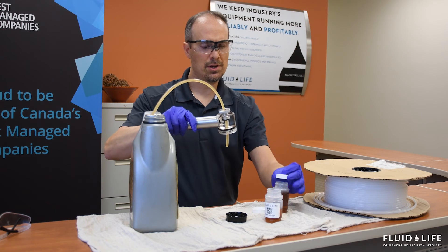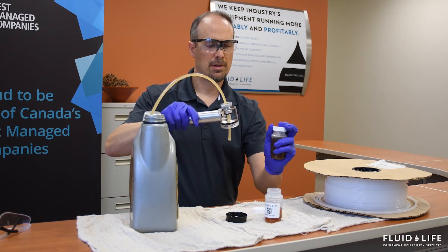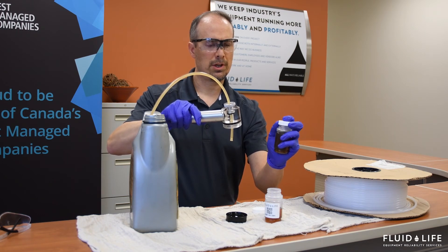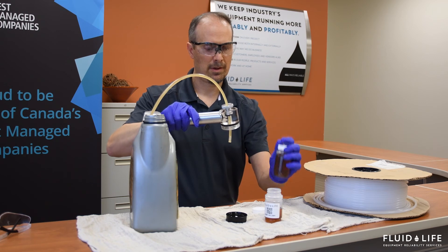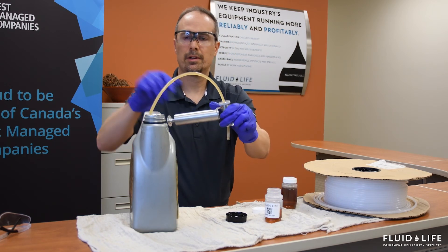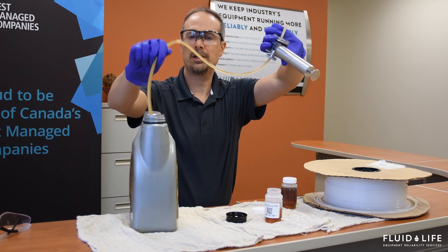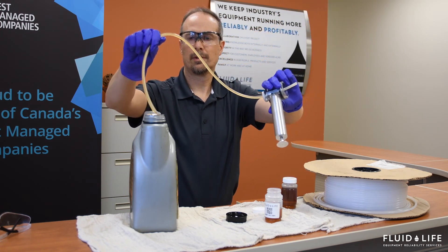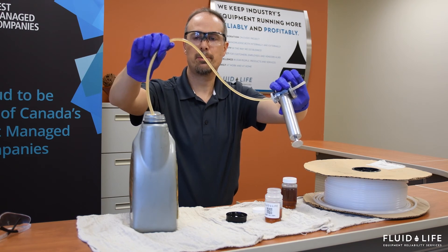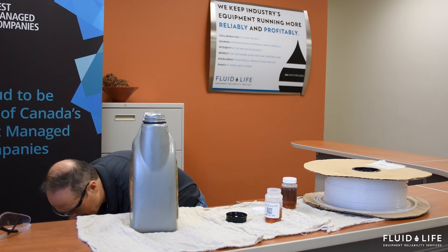Then we're going to cap this off and do our best to put the cap back on. We're going to retract the tube and immediately discard the tubing. These tubing are intended to be one-time use, so you want to discard them right away and use another tube for your next sample.